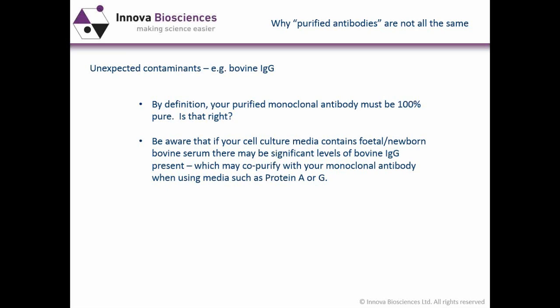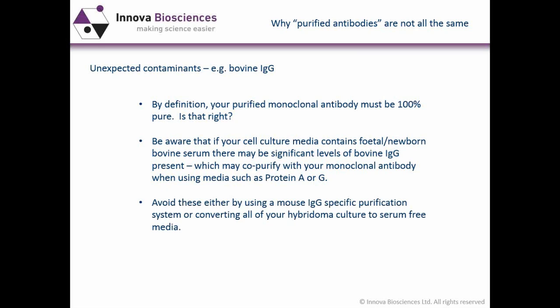You need to be aware that if your cell culture media contains either fetal bovine serum or perhaps worse, newborn bovine serum, there might be significant levels of bovine IgG within that serum. If you use protein A or protein G to purify your antibody, you may well get co-purification of bovine IgG with your monoclonal antibody.